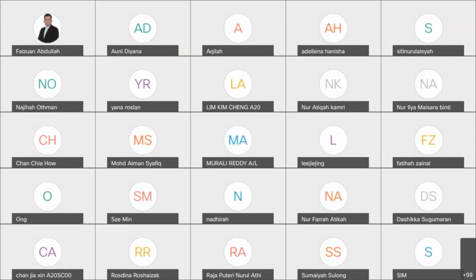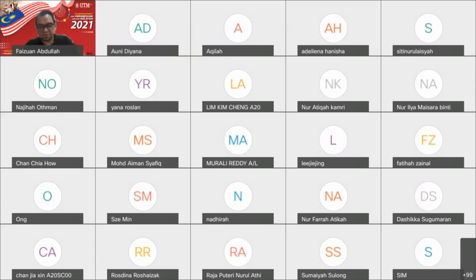Okay. That's all, only a brief introduction on the AAS. What is AAS? Atomic Absorption Spectroscopy. Yes, good. Okay. All right.